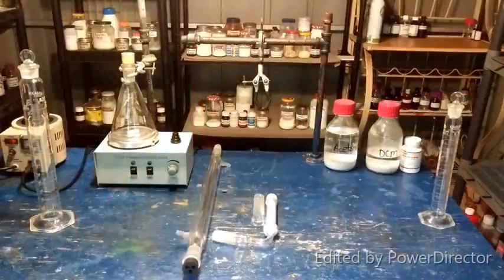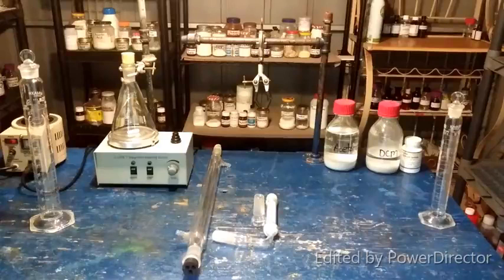Okay, everybody, so here is our basic setup. I'm going to have to do this in the shed because it's going to take a while. I'm not sure how long it's going to take, though. Methyl groups are generally amongst the most active compounds for SN2 mechanisms. So it may not take too long, but I think it's going to at least take a day, being gently refluxed.